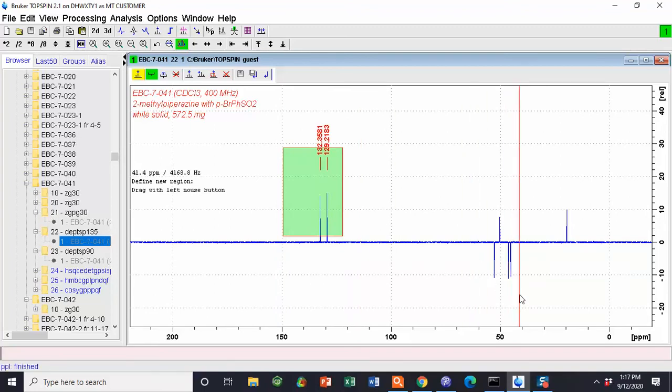To select the CH2s, you do not click and drag down here. What you do is you look at the peak and you estimate how tall it should be if it were to point upwards. From there, you click and drag to make sure that that region is selected. So if you can see, if I just clicked here, it doesn't call any peaks.